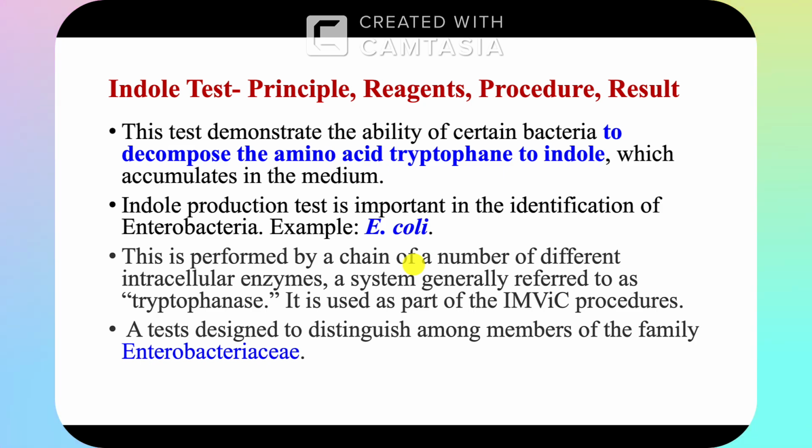Generally, these enzymes are referred to as tryptophanase, because these enzymes break down the amino acid tryptophan.